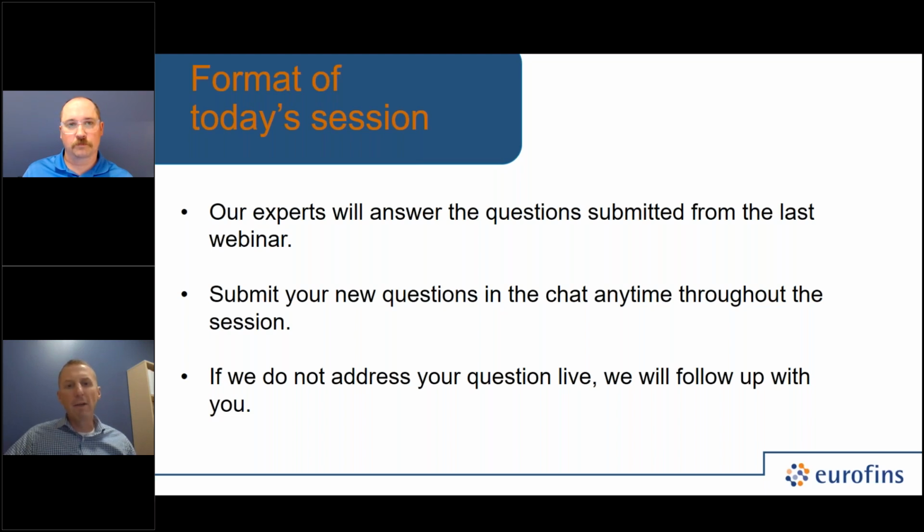Okay, I'm glad you summarized it there towards the end, that each product really needs to be treated differently in terms of the strains that are present, and then the matrix itself when you're comparing the AFU to CFU to really establish what those differences are, and that there's not a one size fits all rule. So let's stay in that same area on our next question here, which is when you report flow cytometry, what are you reporting? Is it just the live? Are you reporting the dead and injured as well? And then again, how does that compare to the colony forming unit or the plate test, and what are the advantages and disadvantages there?